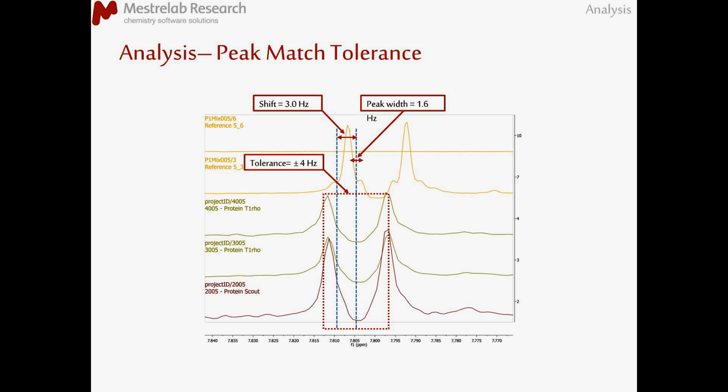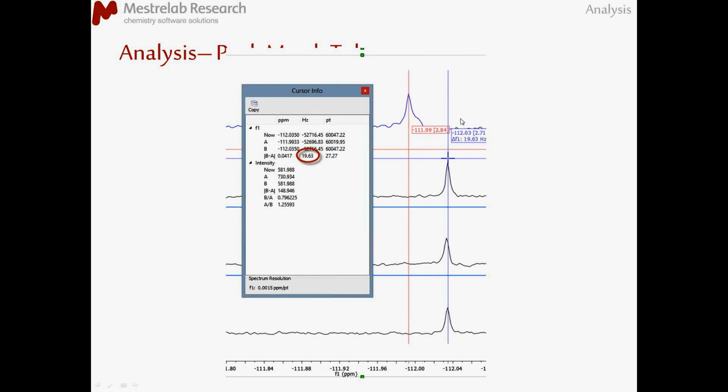And obviously, the range of values that we are looking at for proton tends to be in the region of something like 4 to 6 hertz, maximum 7 hertz. For fluorine, it gets increased by almost 5-fold. So there are values in there.